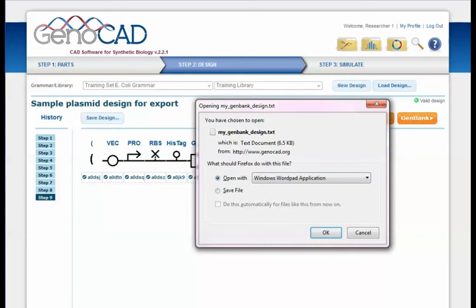Now the best way to look at this on a PC is with the WordPad application, so I will show you how to do that. But this will vary by whatever browser you're using. And I'll just quickly give you a look at the type of file that I'm going to get, so it will help you to understand what we're doing. I will download this, and I'll give you a look at that file when I've got it.